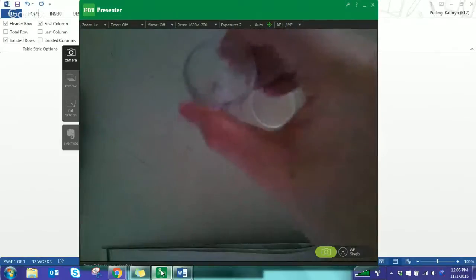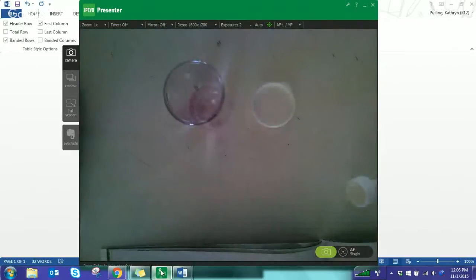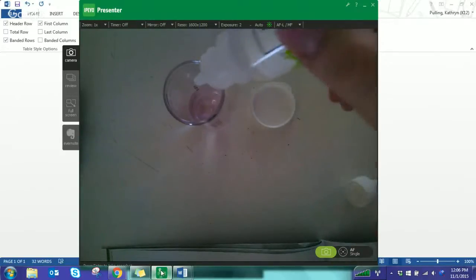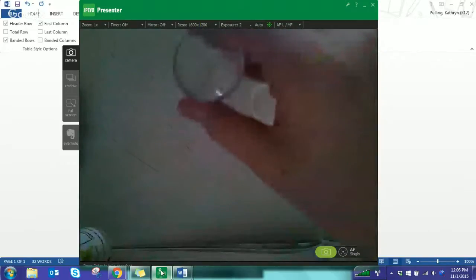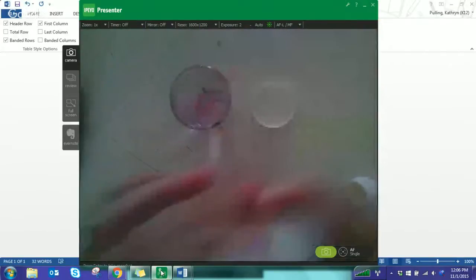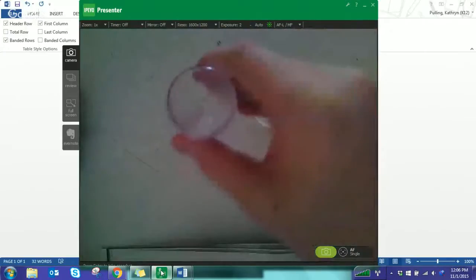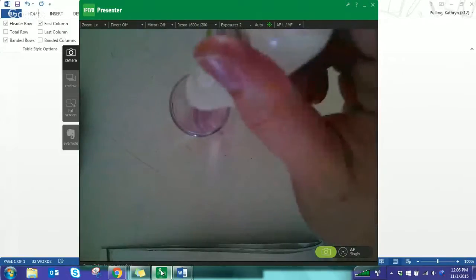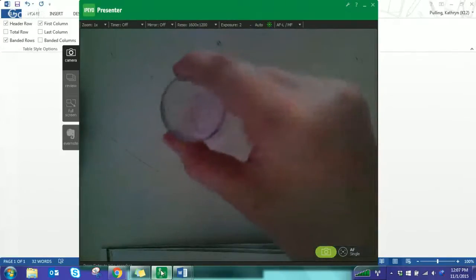And you can almost see a little bit of pink there, but not quite. So it does say the sample should turn and remain pinkish red. More drops of indicator may be necessary to achieve a color change. So I'm going to add another one and see if that gets me there. And I'll keep doing that until I get it to turn nice and pink. Let's do one more. I want it to look like the picture in the lab manual, so I'm going to keep going. I definitely see a pinkish hue going on now, but I kind of want it to be a little bit brighter.